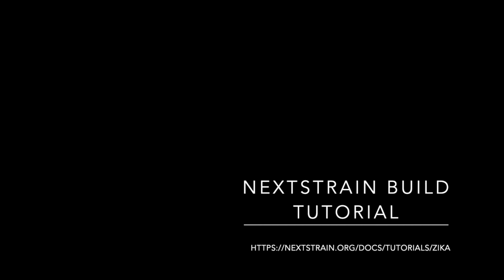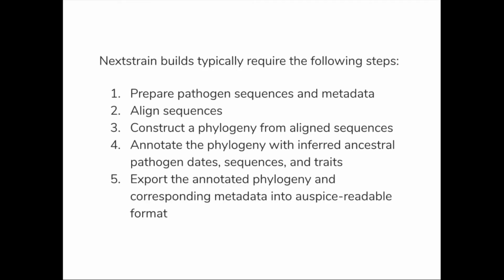I thought it was interesting to create a tutorial for anyone interested in learning how to create a NextStrain build, and I'll be walking through the Zika tutorial. For more documentation, you can go to the NextStrain website to reference that.